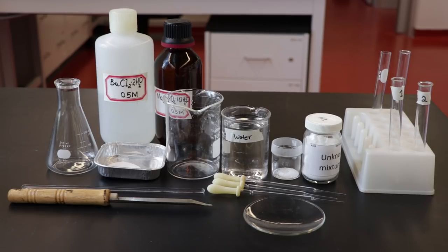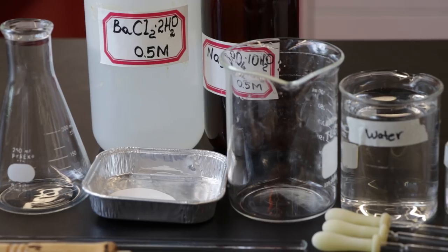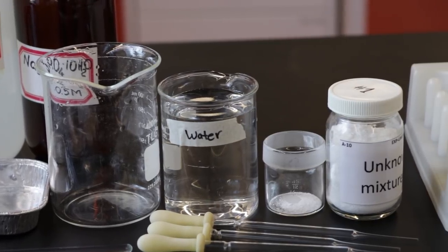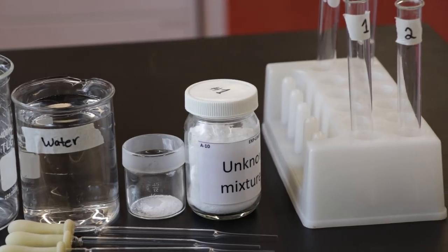First, obtain all the necessary equipment. The unknown mixture will be assigned by your TA. Use weighing by difference to obtain one gram of unknown mixture. A link to the video about weighing by difference is below.